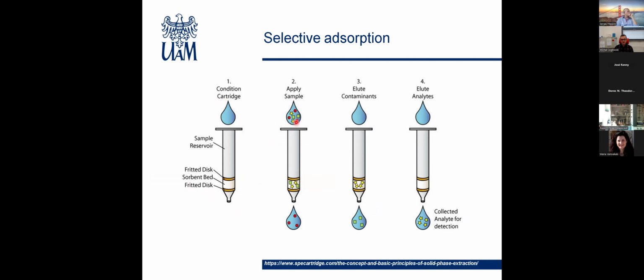Selective adsorption works like this in the simplest possible system: we have a sorbent, we have a solution that has various ingredients, various organic ingredients in my case, and the eluent is passed through the column, and of course the selective adsorbent only adsorbs the particular compounds that it was targeted to. So then we have the adsorbent. We can elute using a special elution system, for instance, strong acid, strong base, that breaks the interactions between the adsorbent and adsorbate to elute particular compounds that we are interested in.